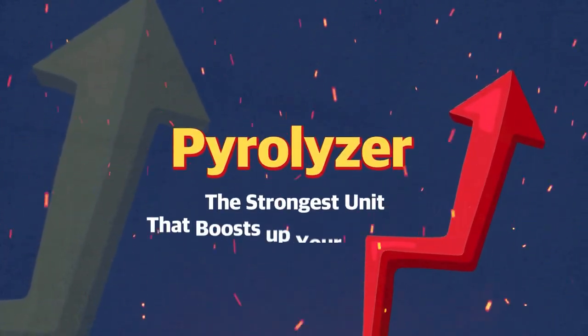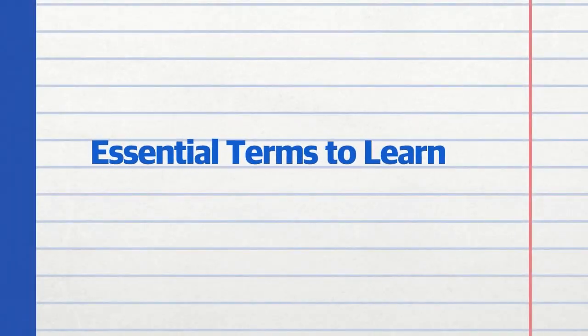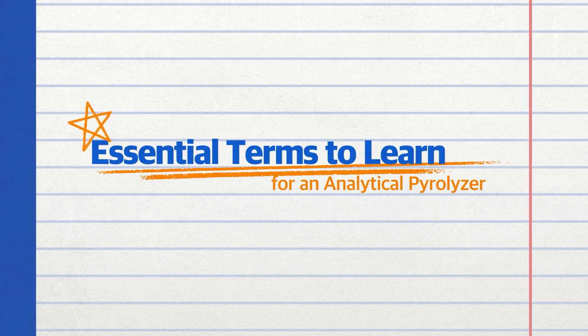The strongest unit that boosts up your capability. In this video, we're going to deal with an analytical pyrolyzer for laboratory use. To fully understand what a pyrolyzer is, there are essential terms you need to learn as prior knowledge.